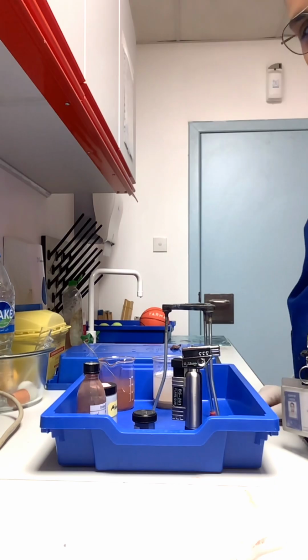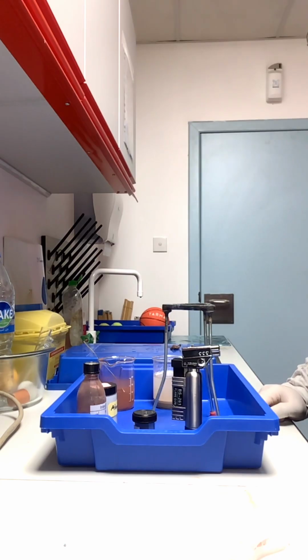Hi dear students, and welcome to our tutorial for today. In today's tutorial we are going to teach you how to do the thermite experiment.